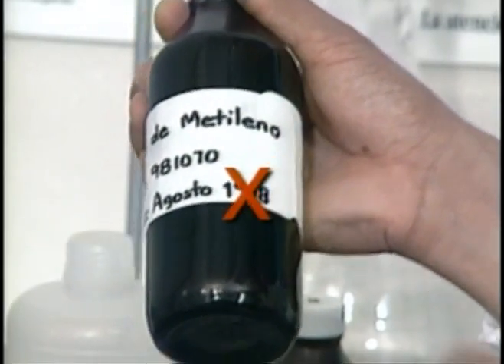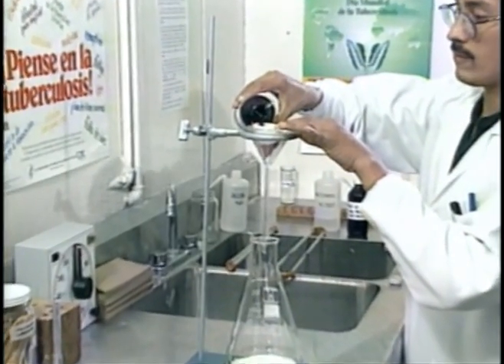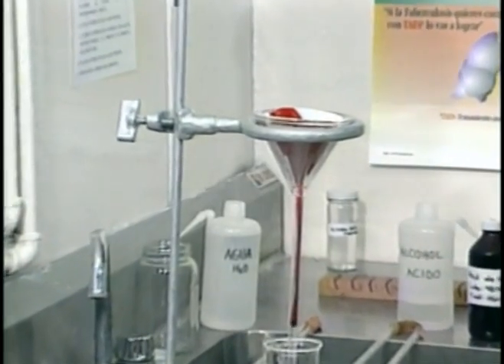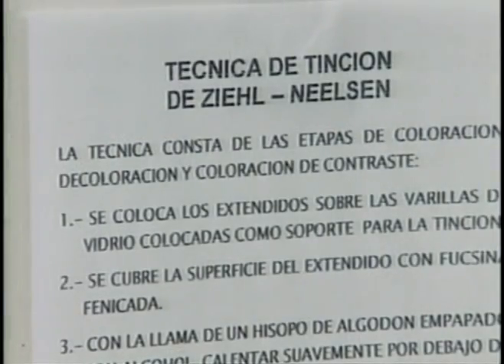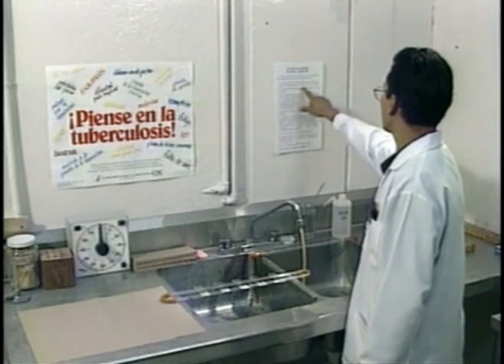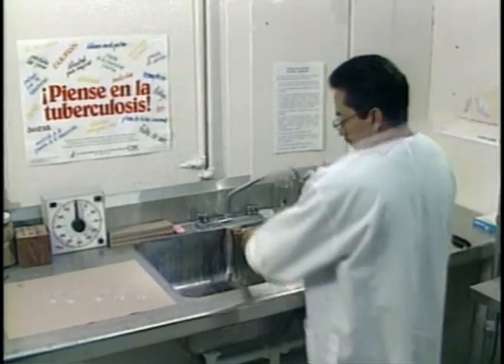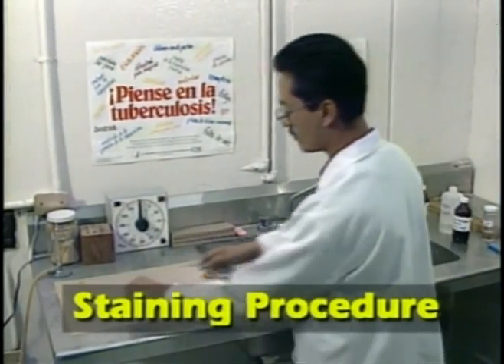Discard all expired reagents. Filter carbol-fuchsin prior to use. If a precipitate is still detected, discard the stain. The staining procedure should be posted above the staining area. To avoid cross-contamination, never stain AFB smears in a staining dish. Now, let's study the important steps of the staining procedure.